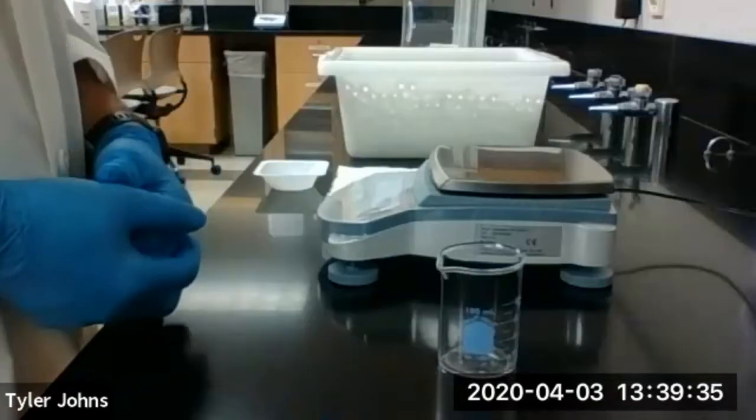Welcome back, chemistry students. Today we're going to be performing the mole lab. Now the purpose of this lab is to relate Avogadro's number and the mole. So let's go ahead and get started.